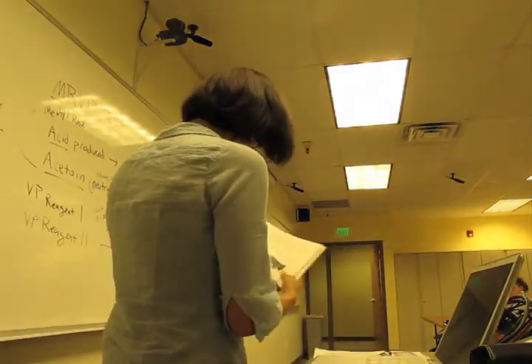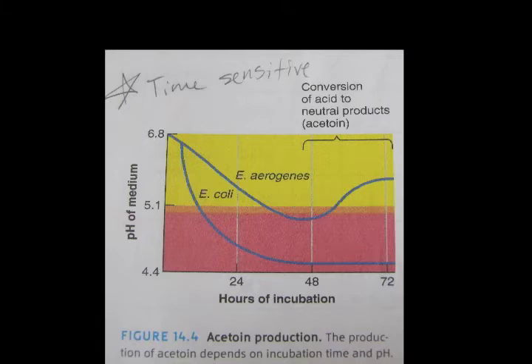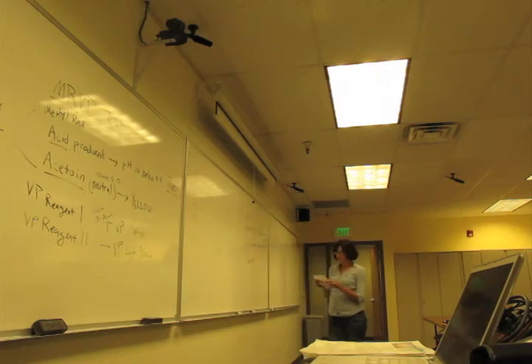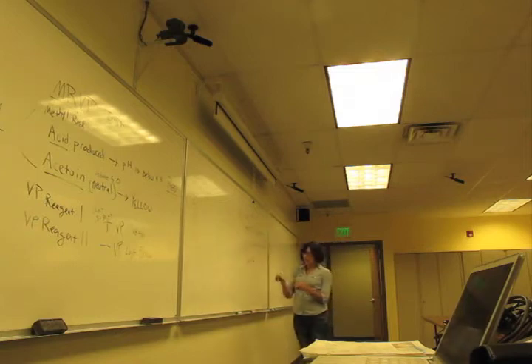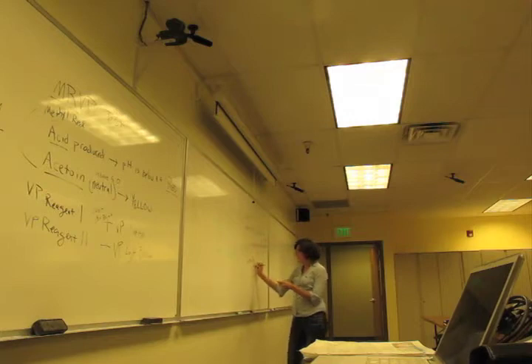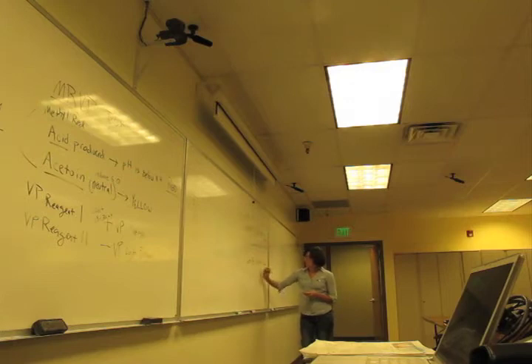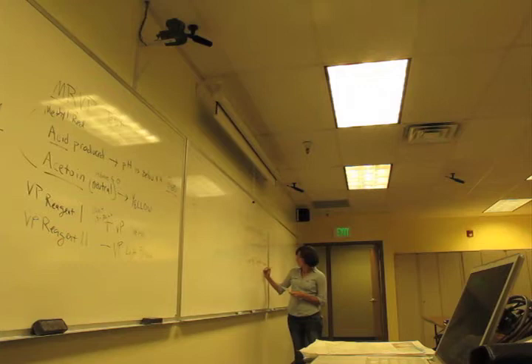There is one more thing that you might need to know. This little chart right here shows you certain bacteria. It will turn red for a period of time, and it might turn back to yellow. I forgot to mention on the carbohydrate fermentation, it'll be red if the byproduct is ammonia. Then the pH will be basic, because ammonia raises the pH, it makes it basic.